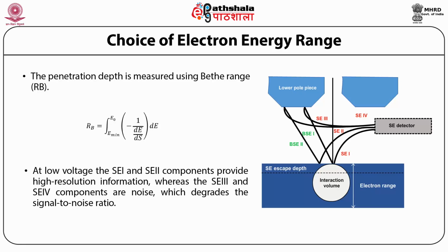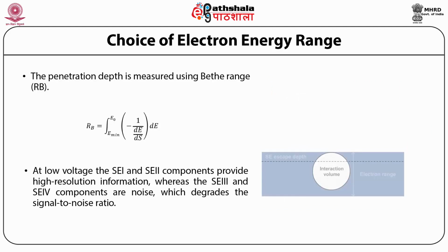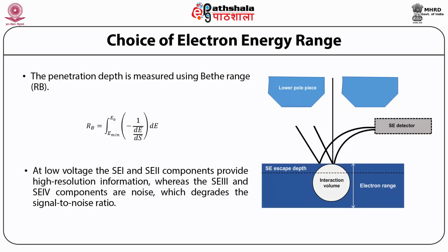In the low voltage SEM, since all the signals are produced near the surface of the materials, even very thin specimens could be treated as bulk. The relationship between the secondary electron and backscattered electron BSE images could be reversed under low voltage operation.